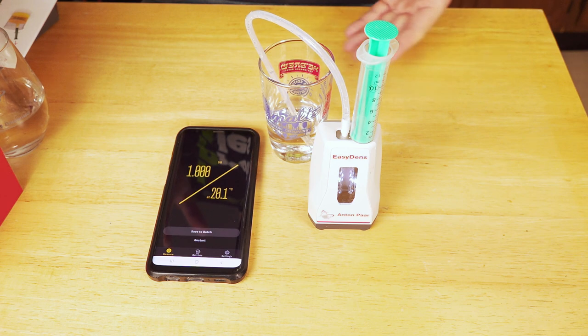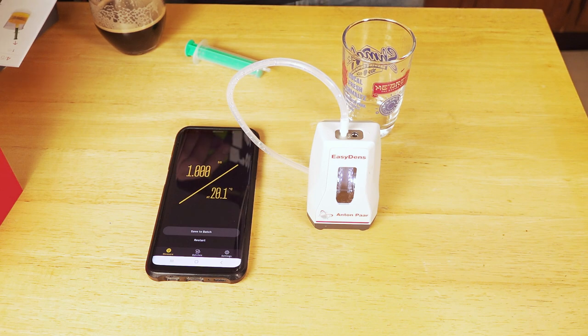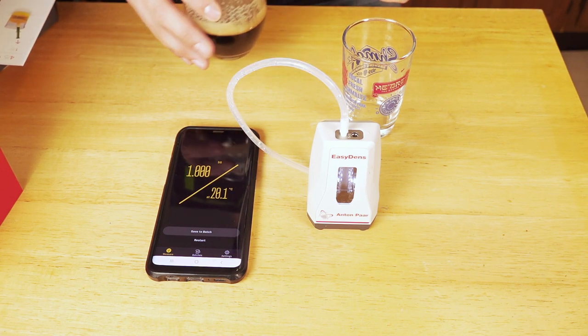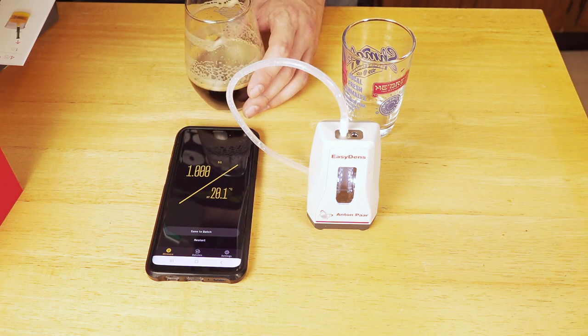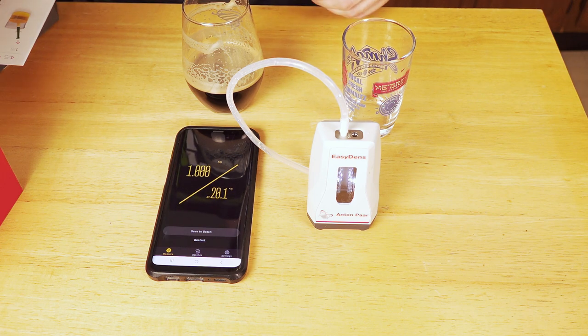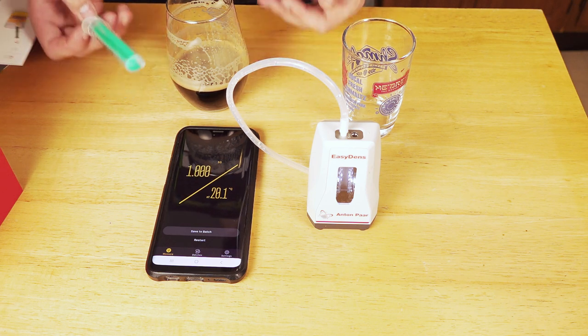All you have to do to clean this thing is take distilled water and push it through a couple times, and it's clean. Now we'll talk about the more interesting part of this, which is what you're actually going to be using it for — just measuring the specific gravity of all kinds of fermenting liquids. This is very easily done in the boil or in the mash, whatever you want, because of the temperature correction. But you can also do this post-fermentation with a carbonated beverage, though you do need to make sure you pull that carbonation out first.